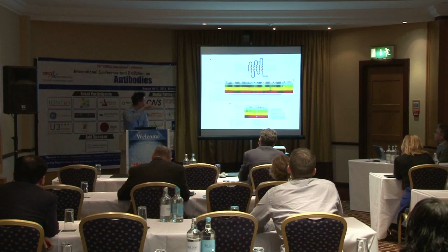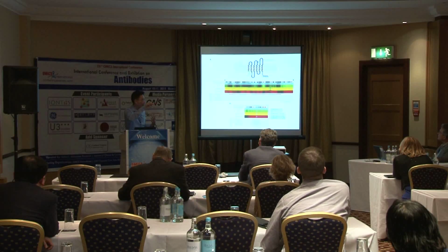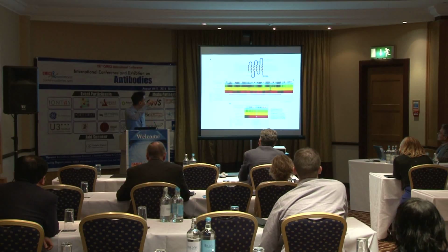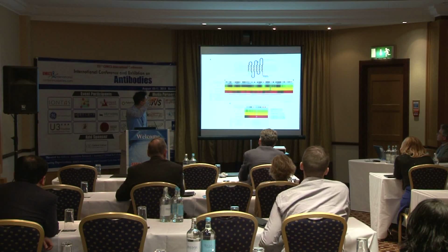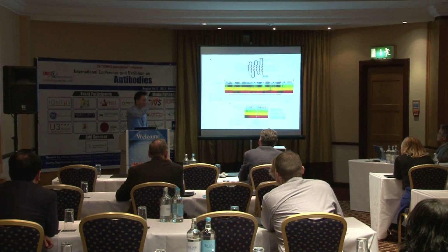The brighter the green, the more immunogenic, so you can spot right away which region is more immunogenic. In this case, you can see the C terminal. This is the water channel, so it's a membrane protein. It predicts that the C terminal and N terminal, the C terminal especially, are more hydrophilic, so it's more clean here.